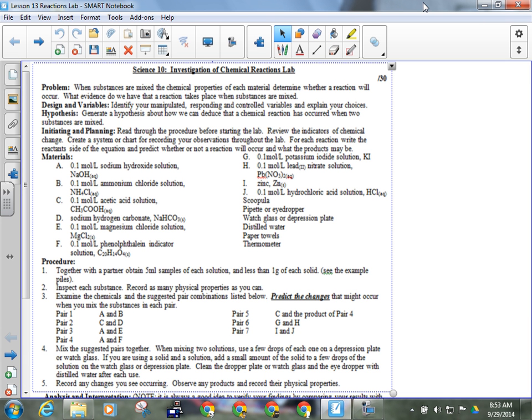If it doesn't, it will contaminate whatever solution you put it in, cause the reaction to happen in that container, and I will be displeased.